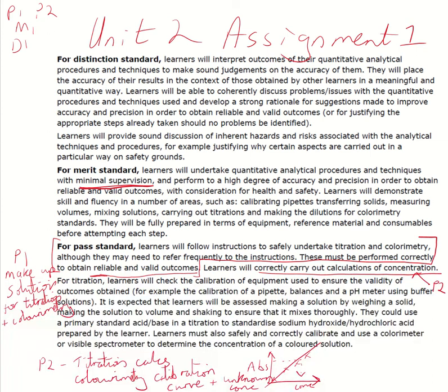So for things like this, obviously just keep an eye on when you're filling up the burette. You've got a funnel in the top. When you're pouring the chemicals in from a beaker, you're at sort of head height for that, and you're not sort of holding the beaker well above your head, in which case it could spill down onto you and obviously is unsafe. And you should have safety glasses on at all times.